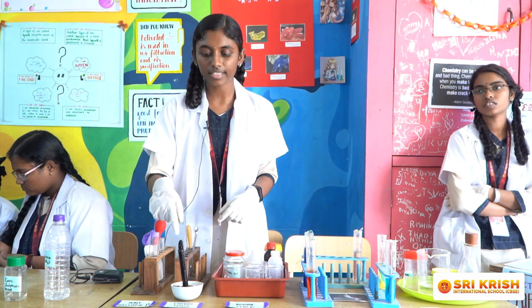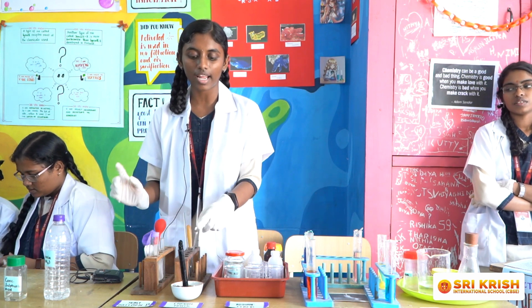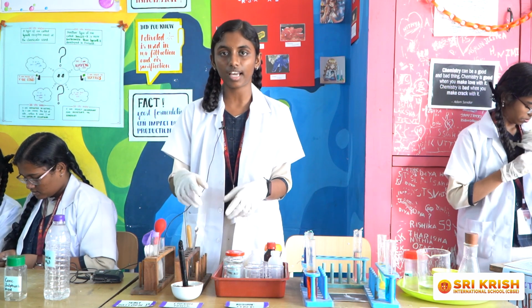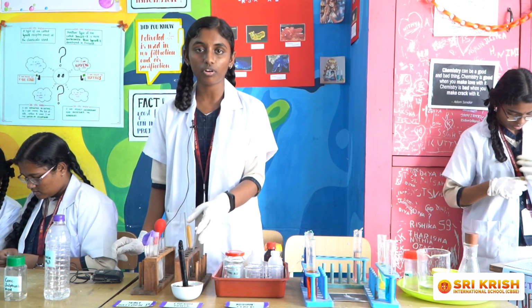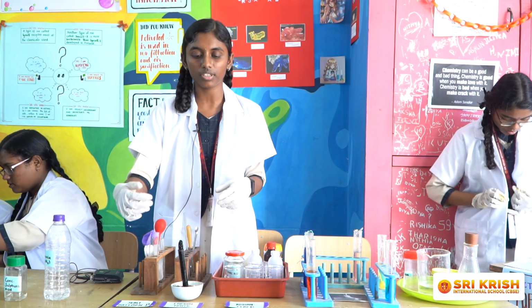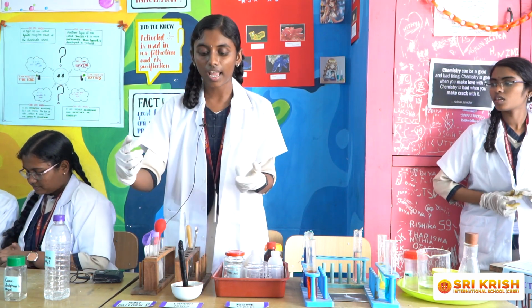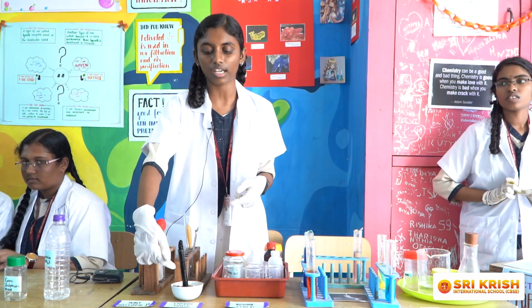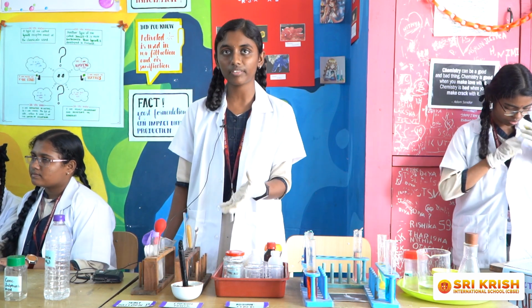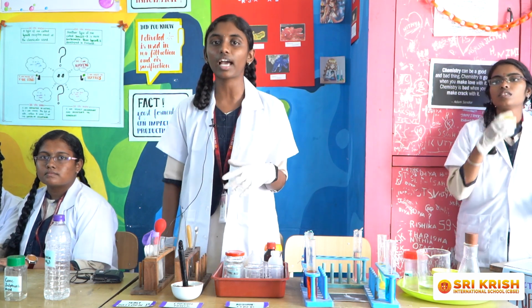This is the purely extracted carbon from the sucrose. So we will be adding sucrose and concentrated sulfuric acid. Here the sulfuric acid acts as a dehydrating agent such that the water molecules will be released out as fumes from the sugar, and the left out carbon will be converted into black color and rise up due to the pressure created. And since it has the appearance of a tower, it is a carbon tower, and the formed carbon is called activated carbon, and this activated carbon is used in H2O filtration and air purification.